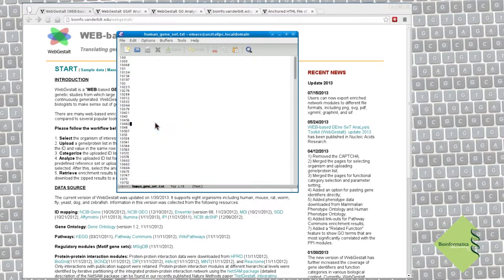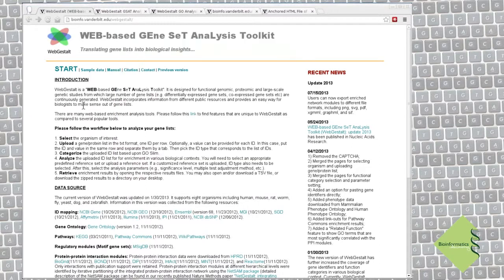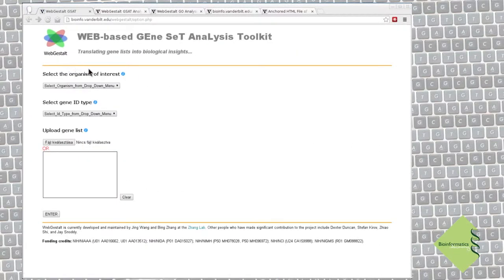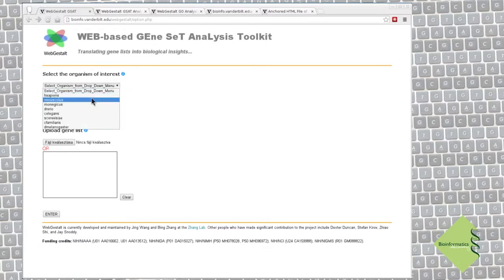Let's go to the WebGestart website. We start the analysis by clicking on the start link. On the first page, we have to say what organism we are interested in. Of course, we have human genes.